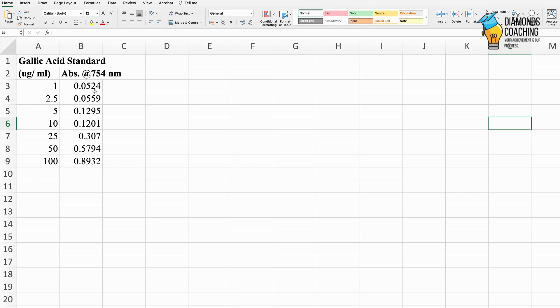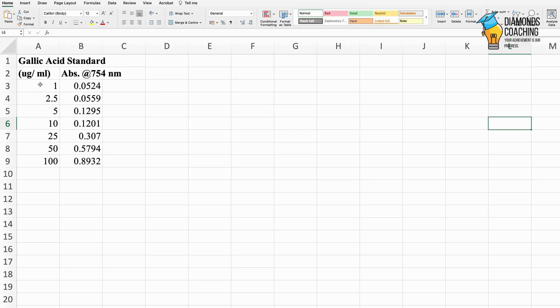Let me show you first how to make a standard graph in Excel. I have my data: concentration and absorbance of my gallic acid standard, and now I want to plot a curve.